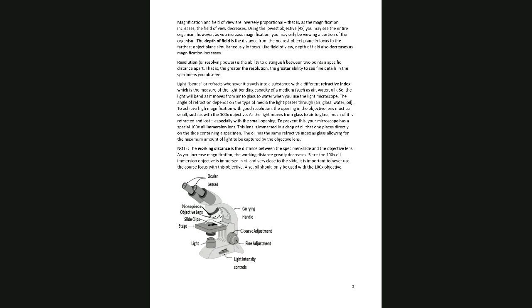You also have this thing. It's part of you. What opening, Christina? Right, the iris diaphragm, right?